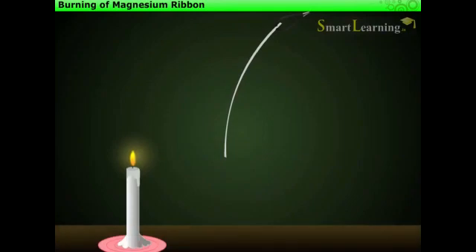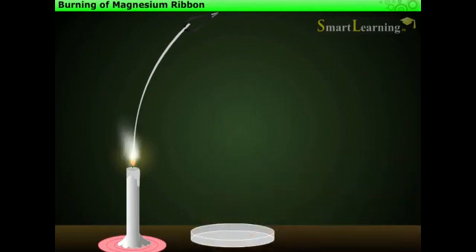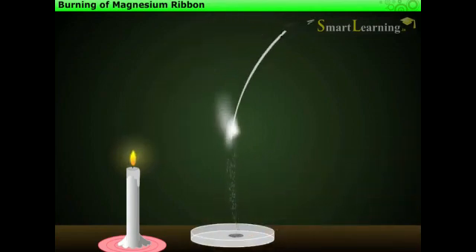Now light a candle and bring the tip of ribbon near the flame. We observe that it burns with a bright white light.